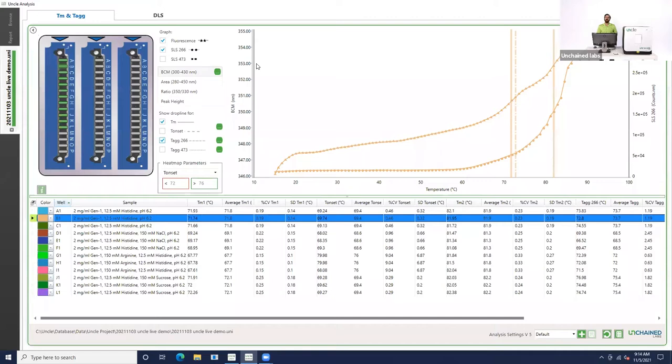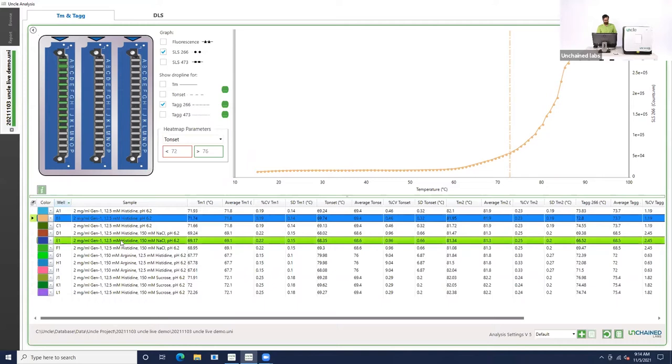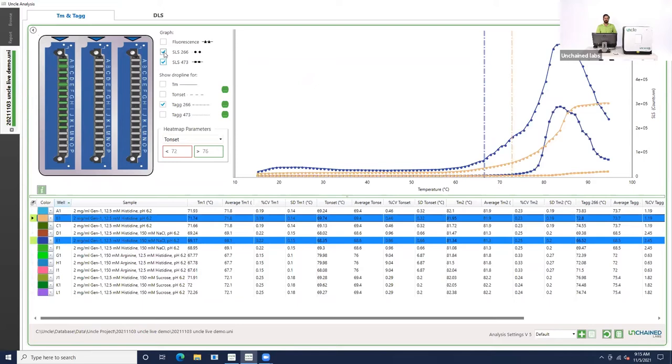If we want to compare the relative colloidal stability of two different samples, we can do that pretty easily. Turn off the fluorescence and the TM, and now let's compare the aggregation of the histidine buffer alone to the sodium chloride buffer. We've got sodium chloride in dark blue and histidine in the peachy color. You can see that by adding sodium chloride to this buffer, we induced aggregation at a much lower temperature, and the degree of aggregation looks a lot higher. That difference becomes even more apparent if we look at the static light scattering of our 473 laser — there you can see an even bigger difference between the histidine buffer alone and the sample containing sodium chloride.